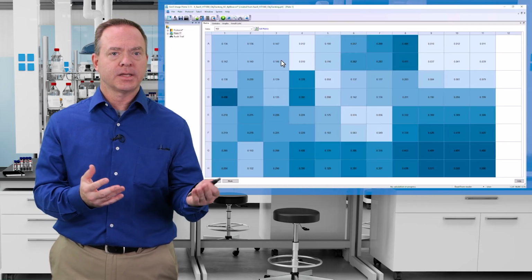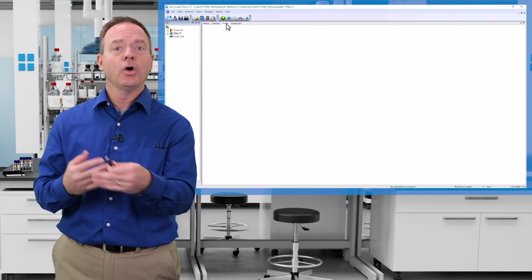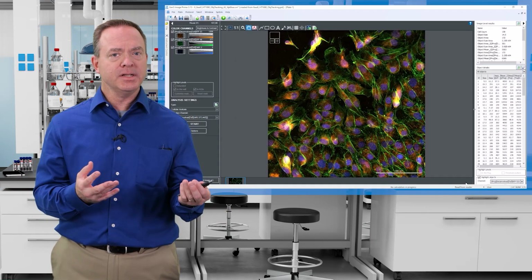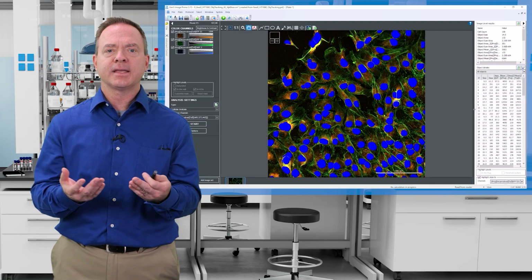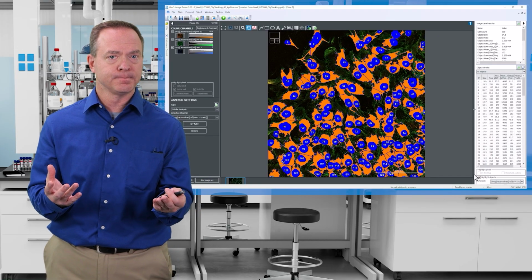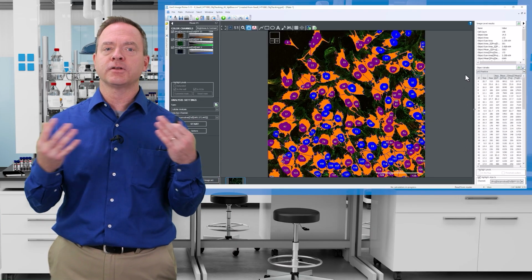Reader-based detection gives a wide variety of information quickly through the incorporation of an absorbance, fluorescence, or luminescence plate read, and can be used to gain mechanistic insight. Transmitted light and wide field microscopy let us dig a bit deeper and get more specific details, such as how many objects or cells play a role in the results we've seen. What are they doing and why? And how do they interact and change the environment around them?